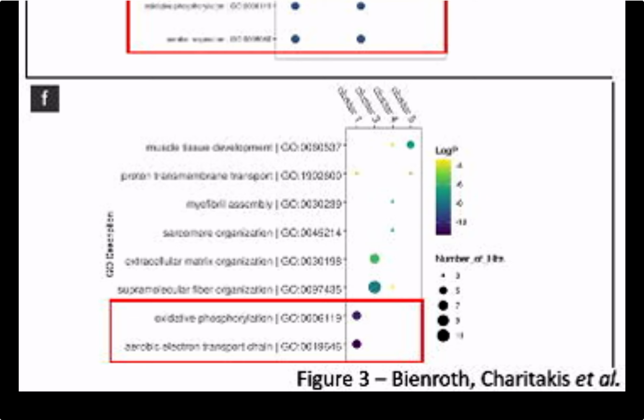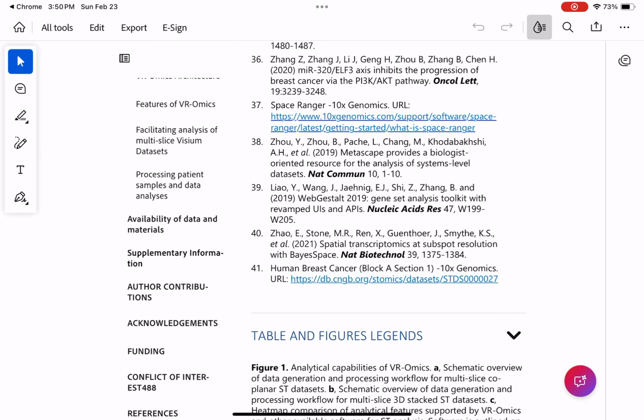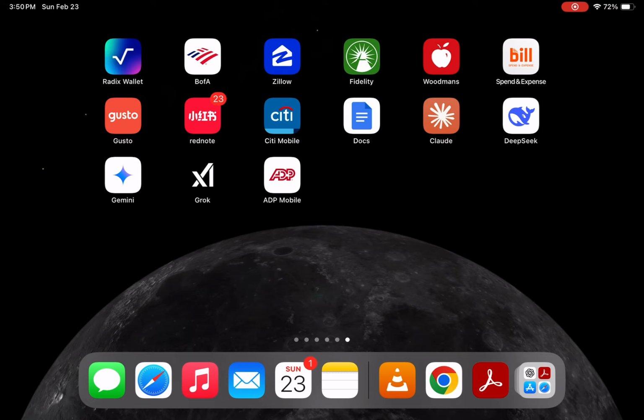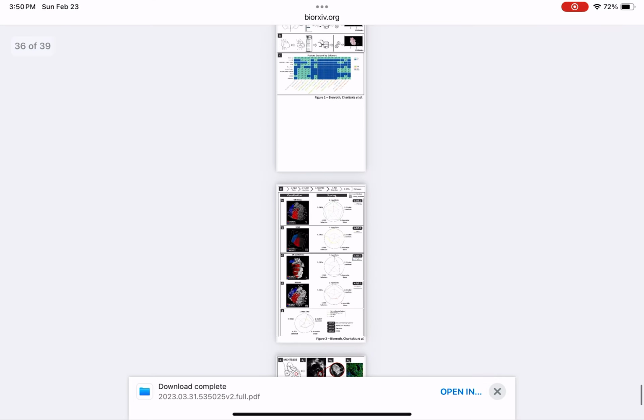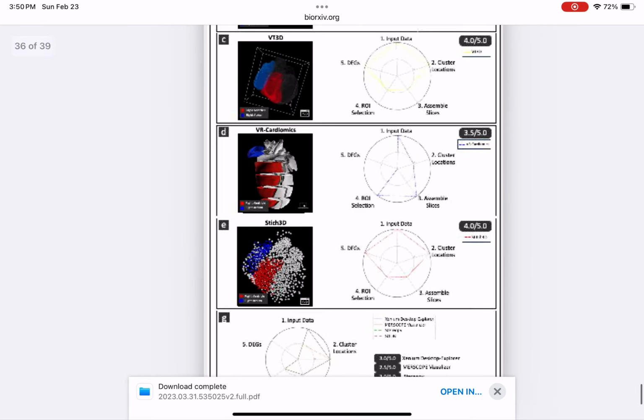We were fortunate to have access to samples from a second patient to investigate the presence of the transcriptional signature across CRMs with distinct etiologies. The second patient, MCH-TB361, presented with a CRM in the left ventricular outflow tract and had been diagnosed with tuberous sclerosis complex, TSC, which is commonly linked to CRMs.